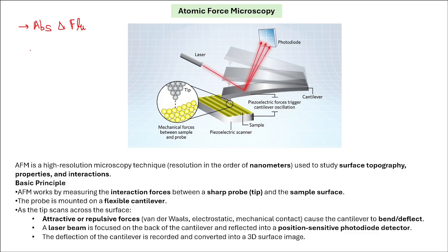Next we discussed electron microscopy, in which we visualized what kind of nanoparticles were formed, and based on the spectra, we studied the characteristic spectra that particular kinds of nanoparticles or compounds will yield.